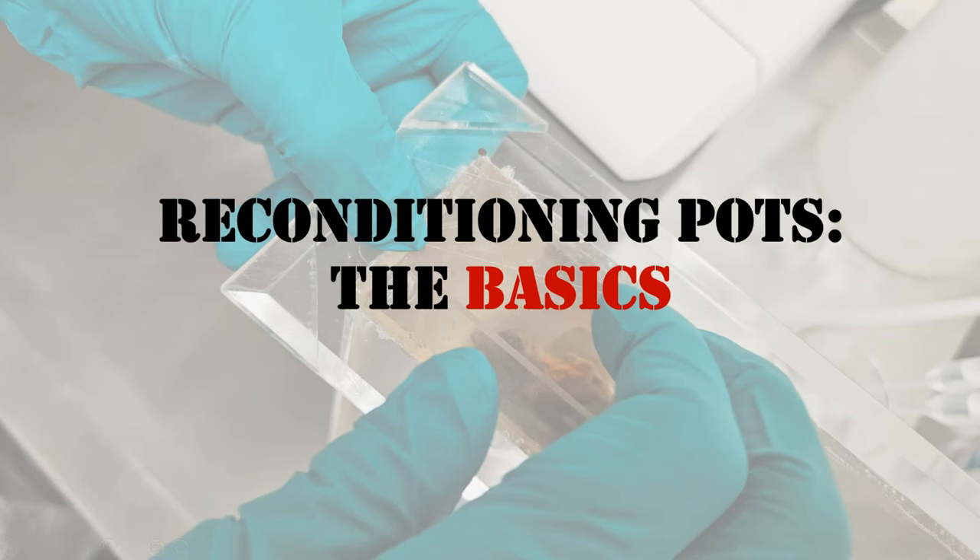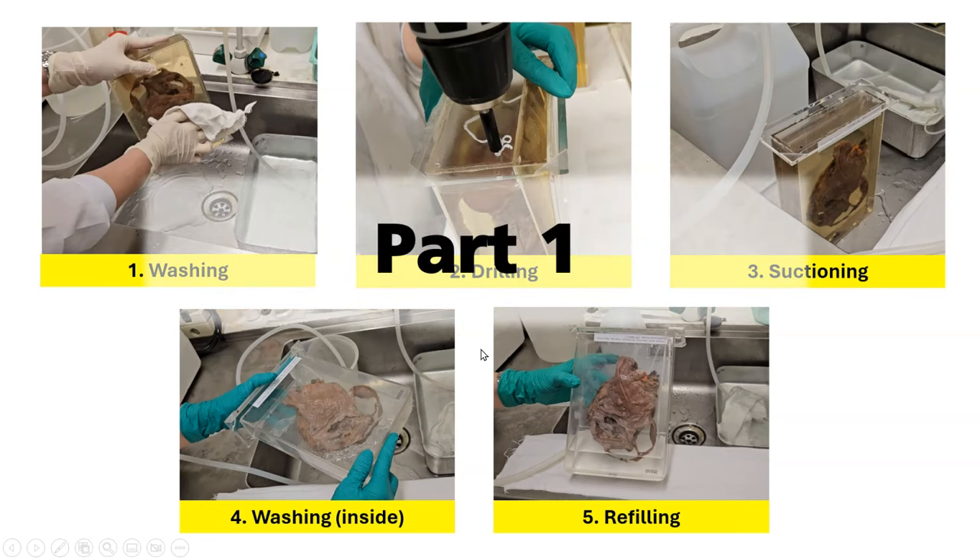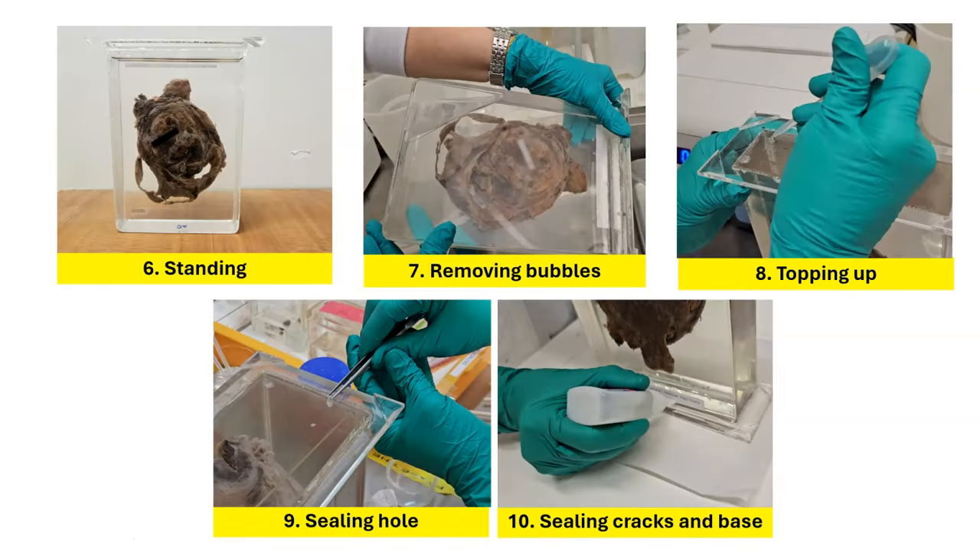Let's look at the basic steps in reconditioning pots. First, the pots are washed externally, and then a small hole is drilled into the base. The preservative fluid is siphoned out using a pump. The pots are then washed internally, and they are refilled. We will look at these five steps in the current video in part one. And in the next part, we will continue to look at the steps of standing, removing bubbles, topping up the container with preservative fluid, sealing the hole, and sealing the specimen base.